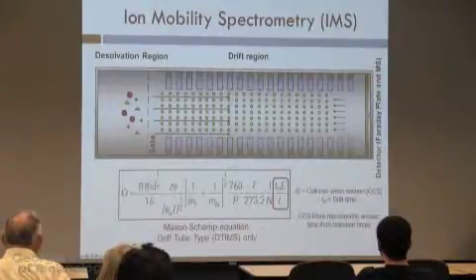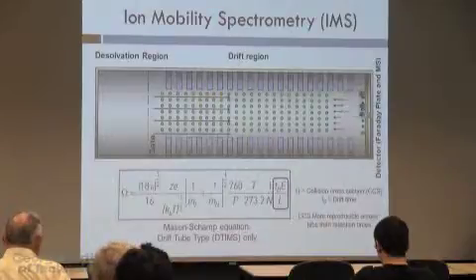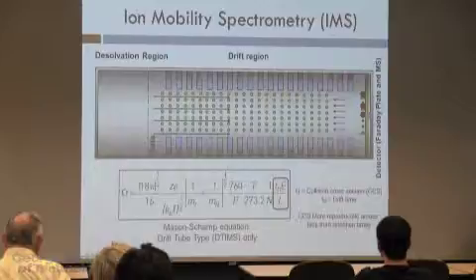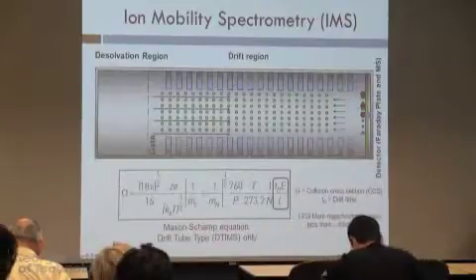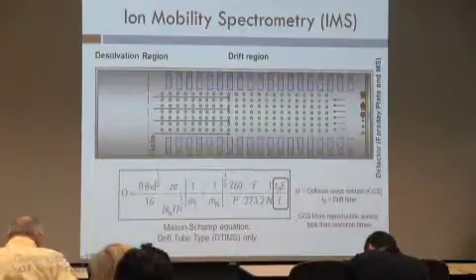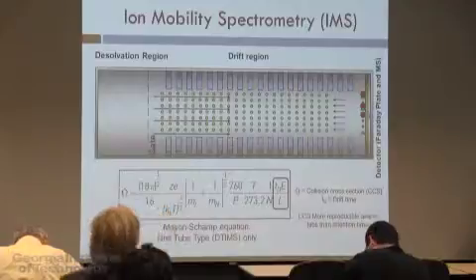So an ion mobility is like a gas phase electrophoresis. Okay, so you make ions, and then those ions fly down a tube, and there's a gas that flows against the ions and separates them. What's intrinsic about this process is that molecules are separated based on the collisional cross-section. And that's the shape of a molecule in the gas phase. Okay, and that's very intrinsic of a molecule, and it doesn't change between labs. So if you can measure that, and you can match the collisional cross-section, you can have an additional way of saying, yes, this is the molecule I think it is.